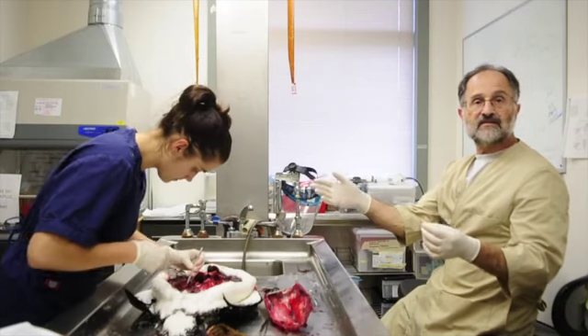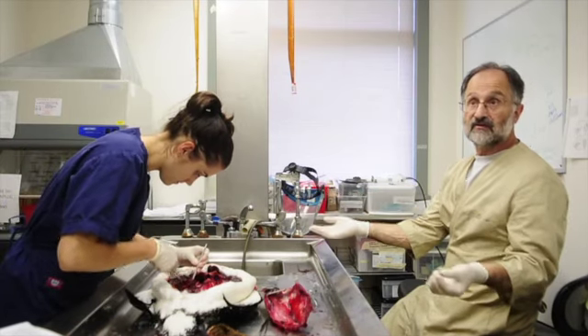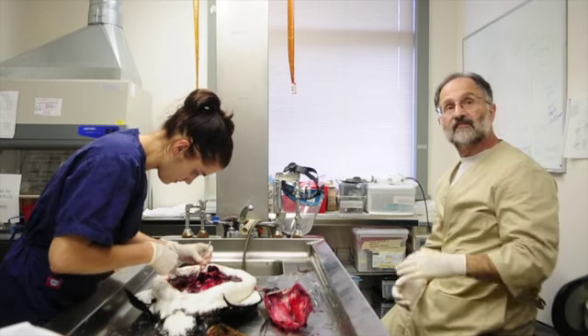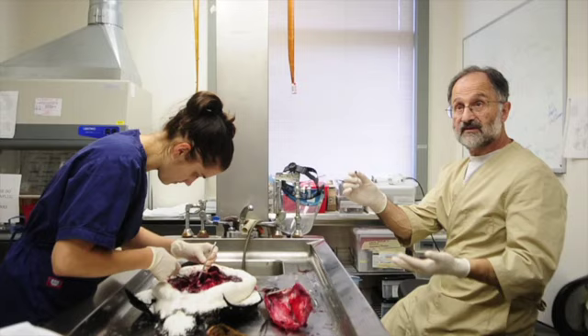The bloody fluid from this animal has more lead in it than we can actually measure. When I find something like that in the bird, it's real common. So there's no question that this was the cause of death.